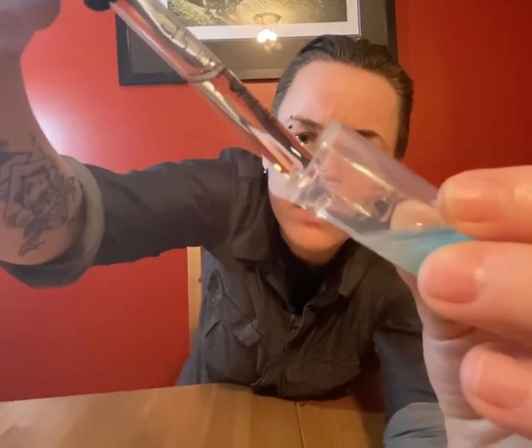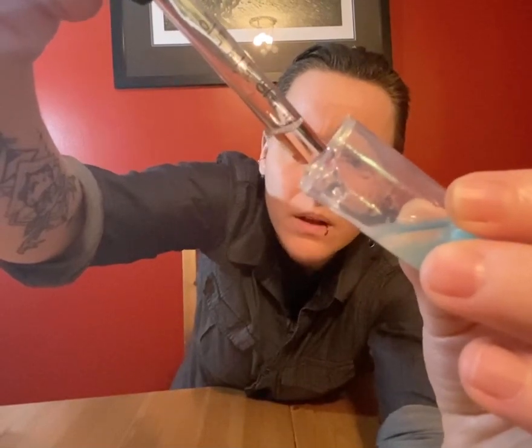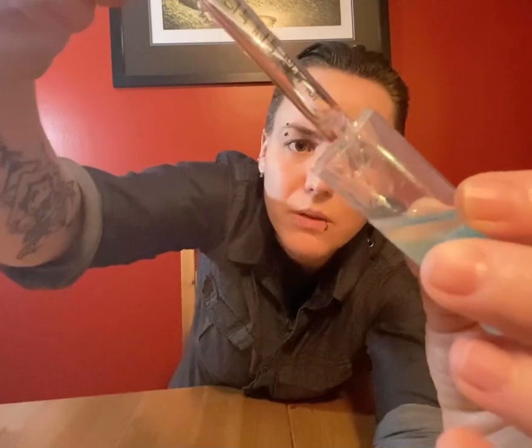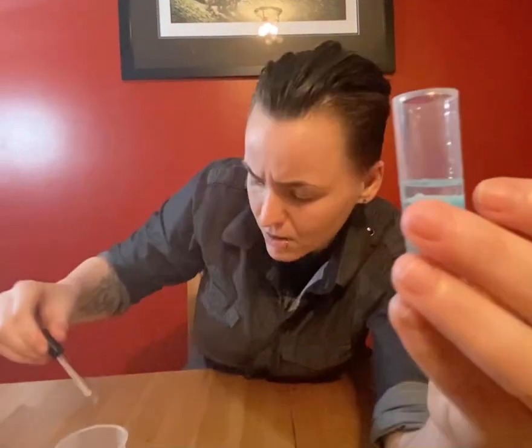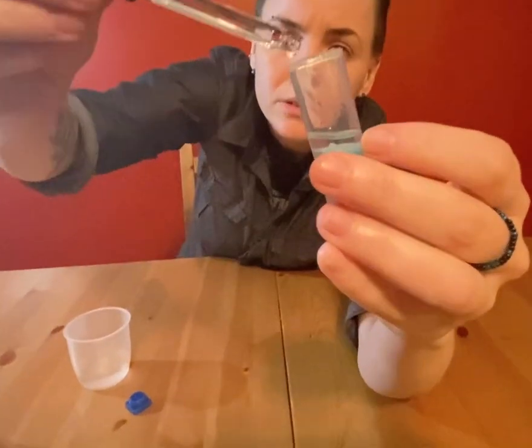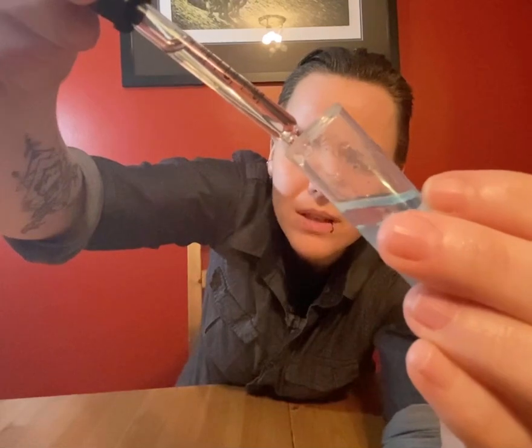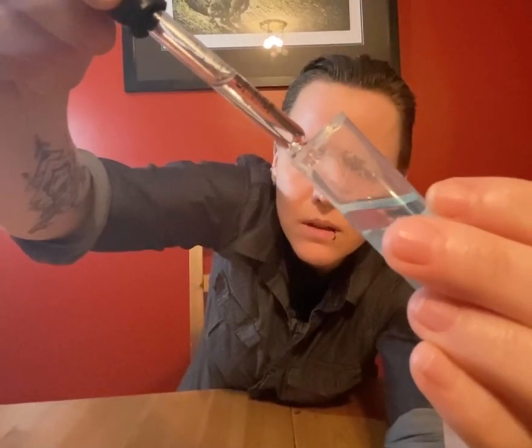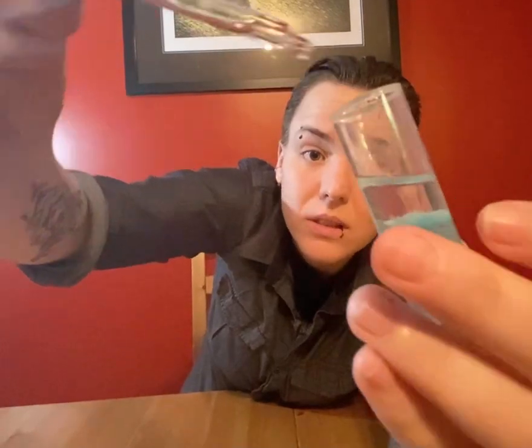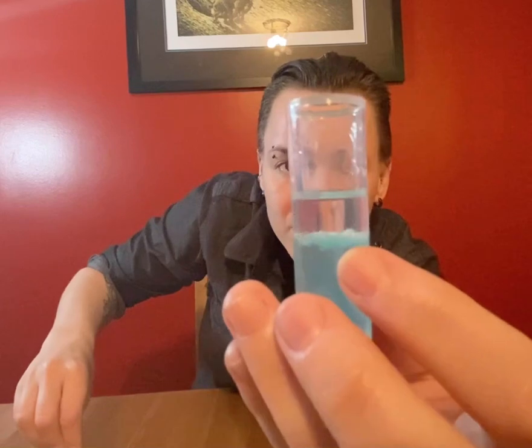You don't want to be very aggressive with it and release it really fast. You want to be really, really gentle with it so that it floats on top. And then I'm going to put some more in. So you take this and, again, very, very slowly put more on top. And you notice how the alcohol sits on top of the solution? And you notice that there are little bubbles forming inside?